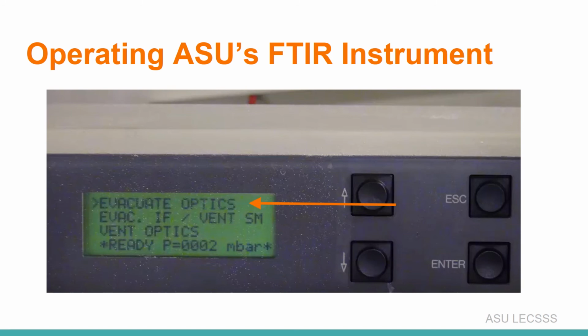And then here's just another quick picture if you'd like to see the complexity of this machine. This specific image represents the evacuating portion of the test, as you can tell. Those are the up and down arrows, and the enter. You don't really use the escape at all.